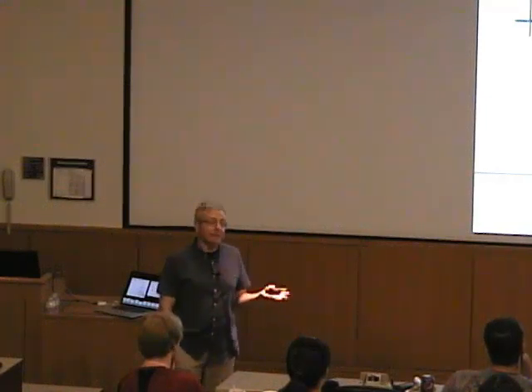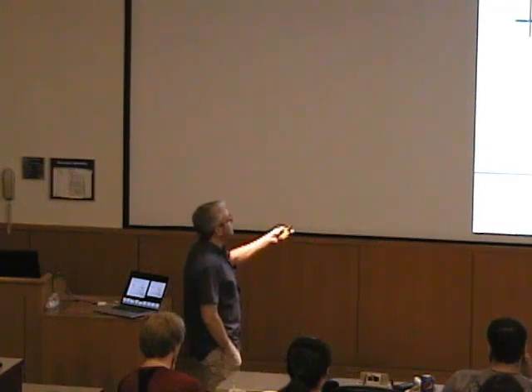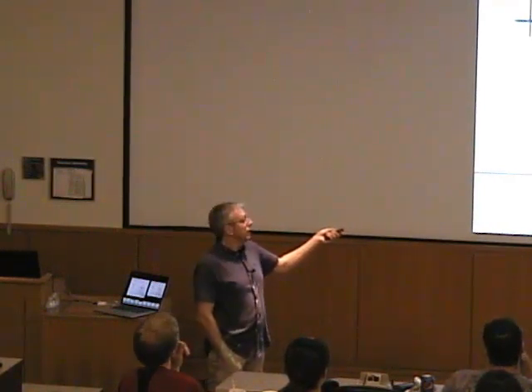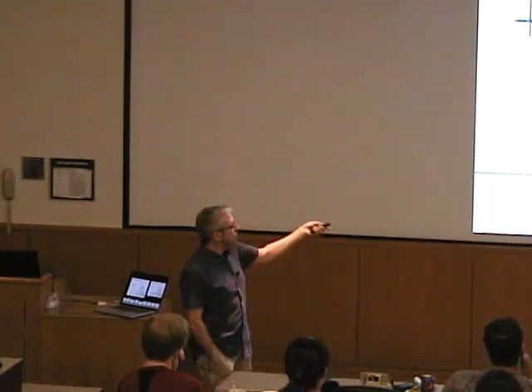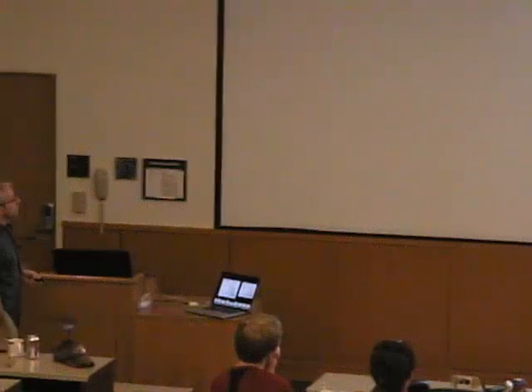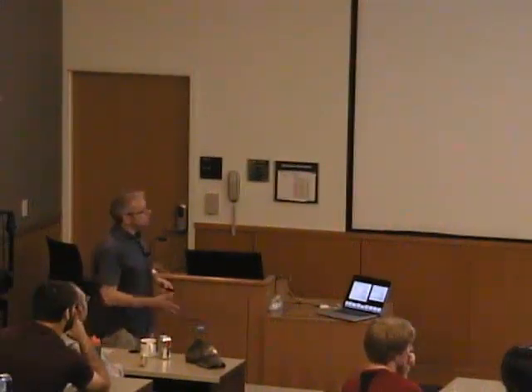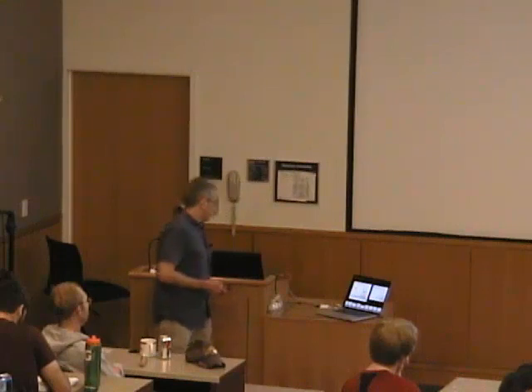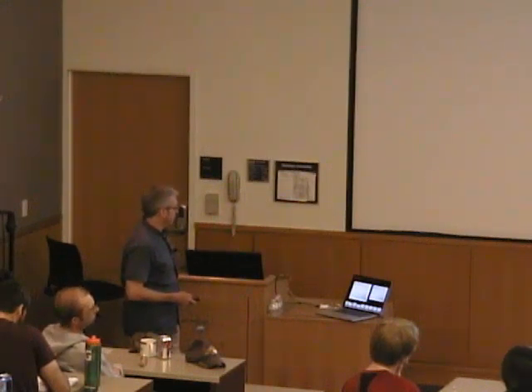Does it help you? Well, it does help you if the structure is simple enough, because the picture of your molecule is in there. And if you do it right, you can also actually derive positions of atoms from here. So that does work quite well. So the Patterson function is a good tool to solve simple structures. It does work if you have something like 100 atoms, and it's something that can be done not so badly.